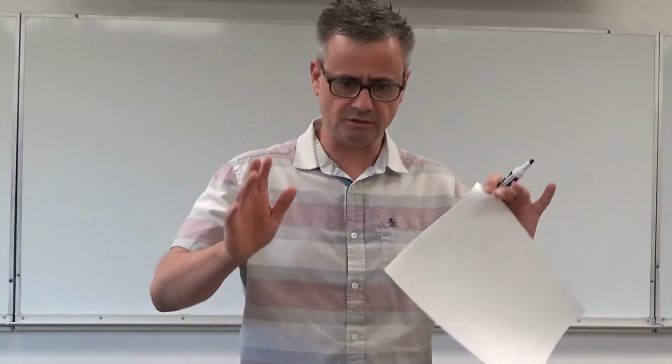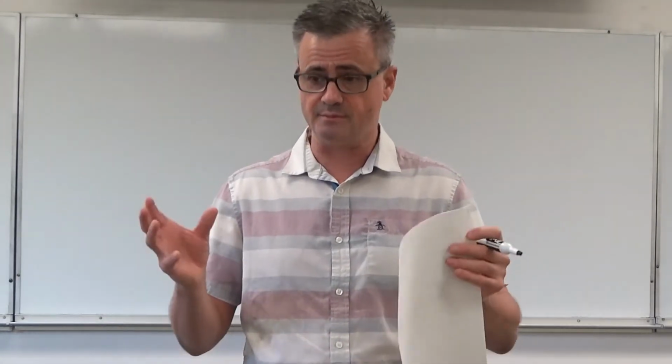We're going to talk today about the titration of bleach. I don't know if it's occurred to you guys or not, but it may seem like we do a lot of titrations in this class, and we do. But as a teacher, I'm not very bothered by that. I think it teaches a lot of good lab technique, although you guys are just watching it, so a little bit less than if you were doing it yourself. But we also do them in a lot of different contexts.